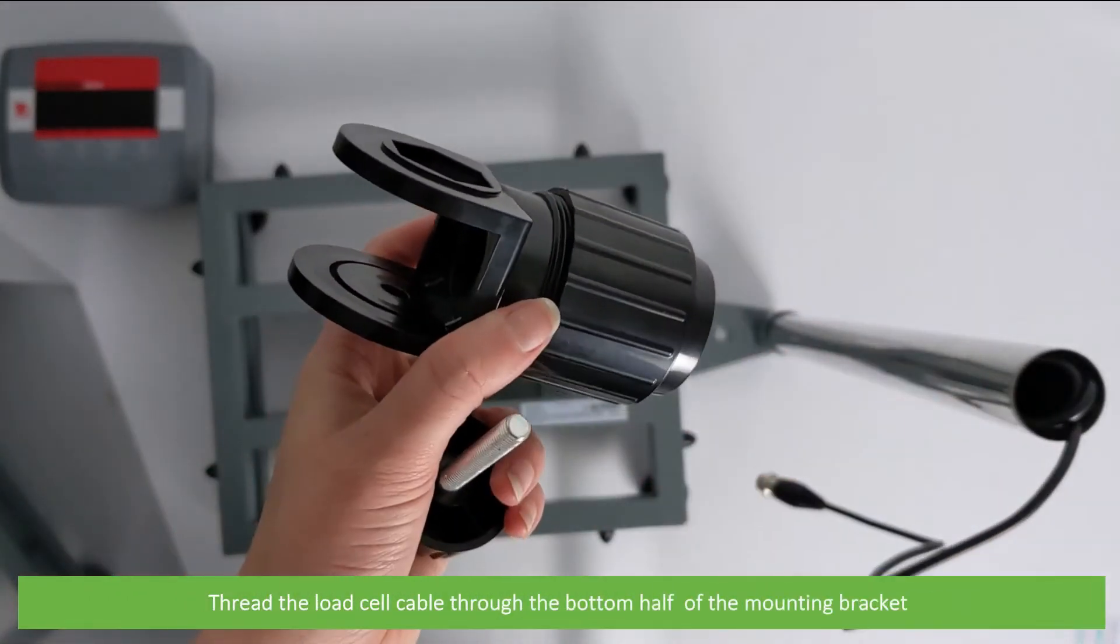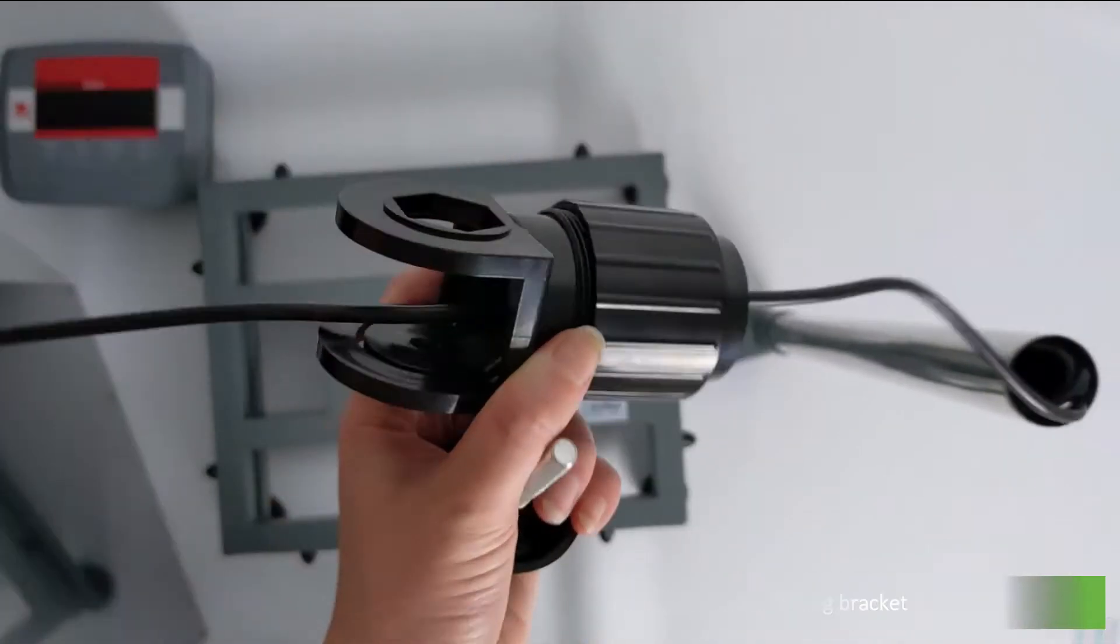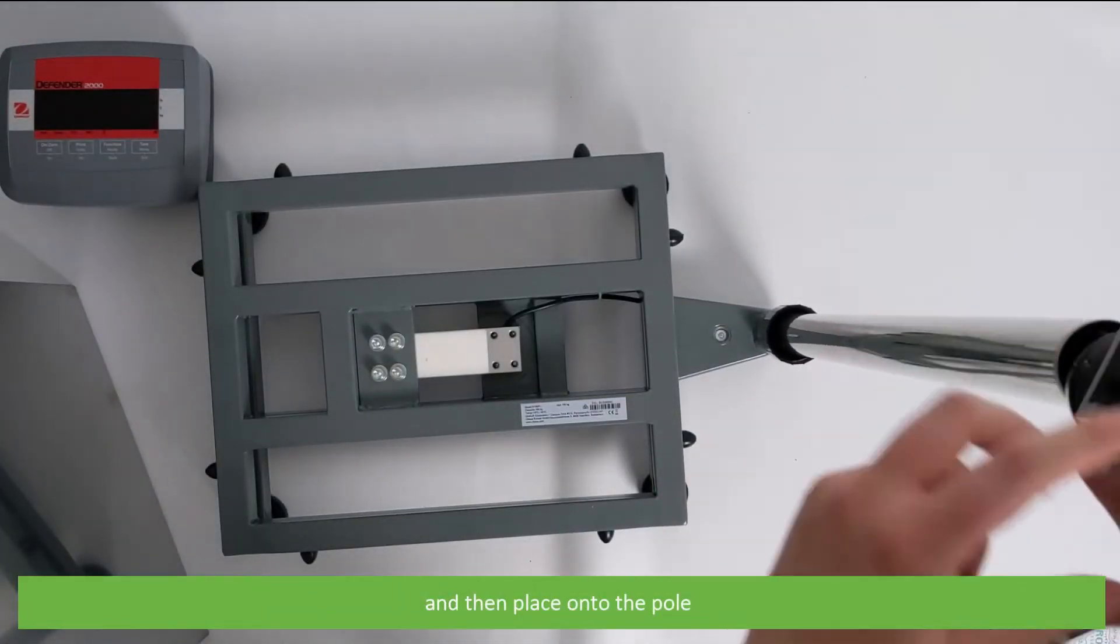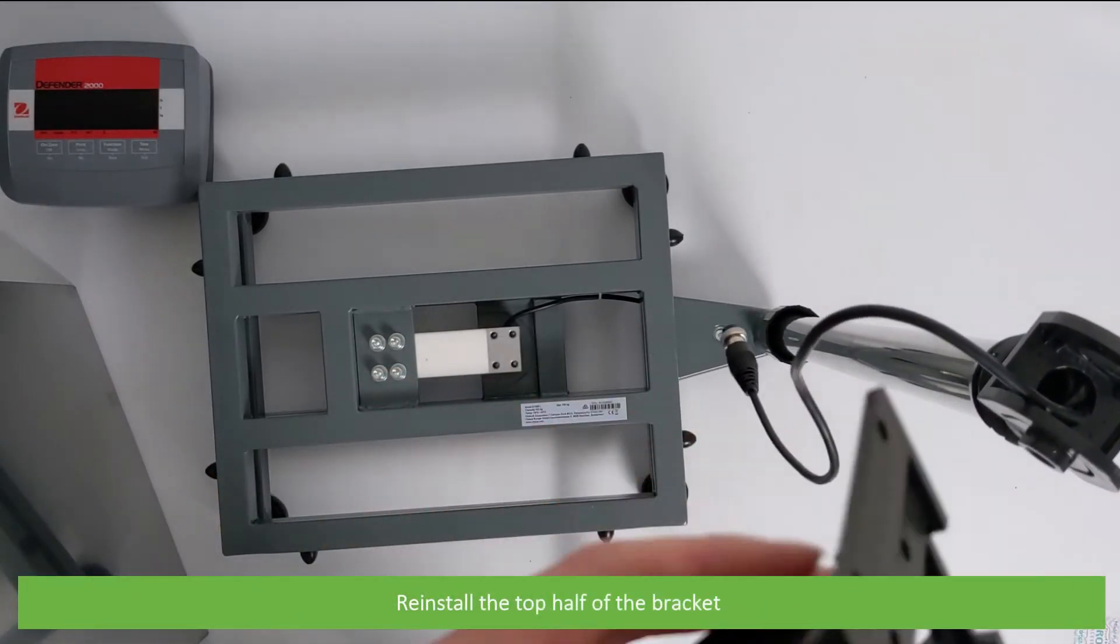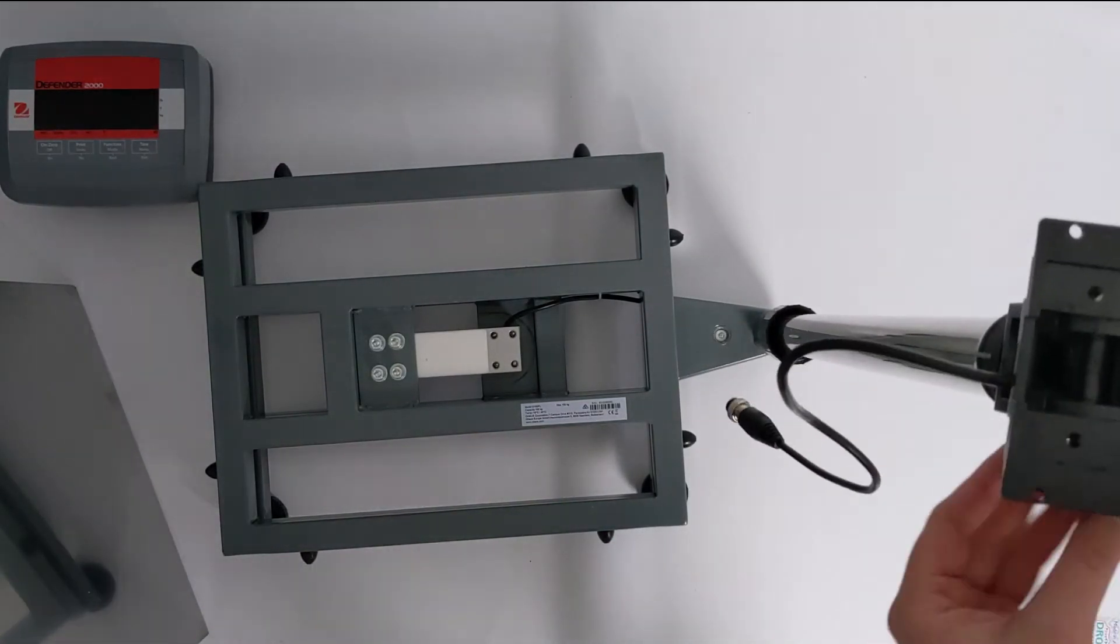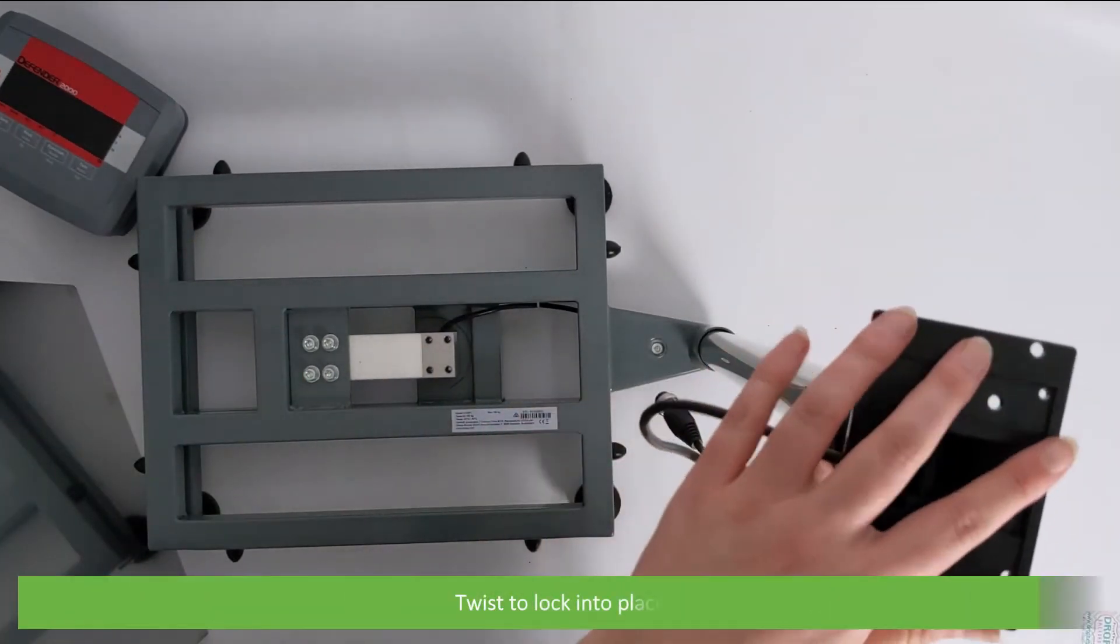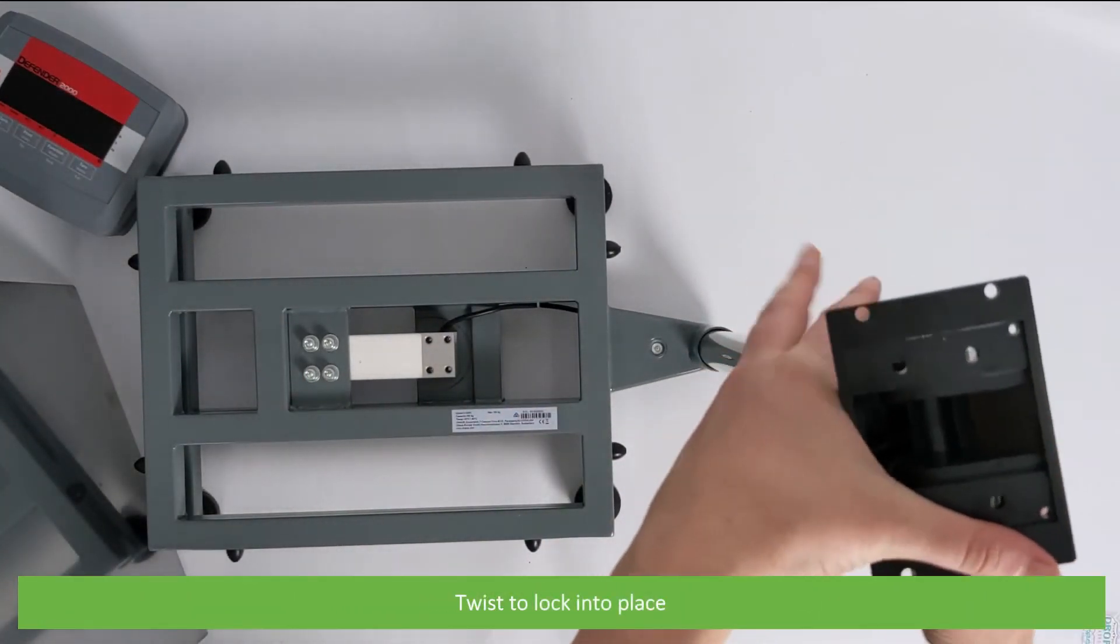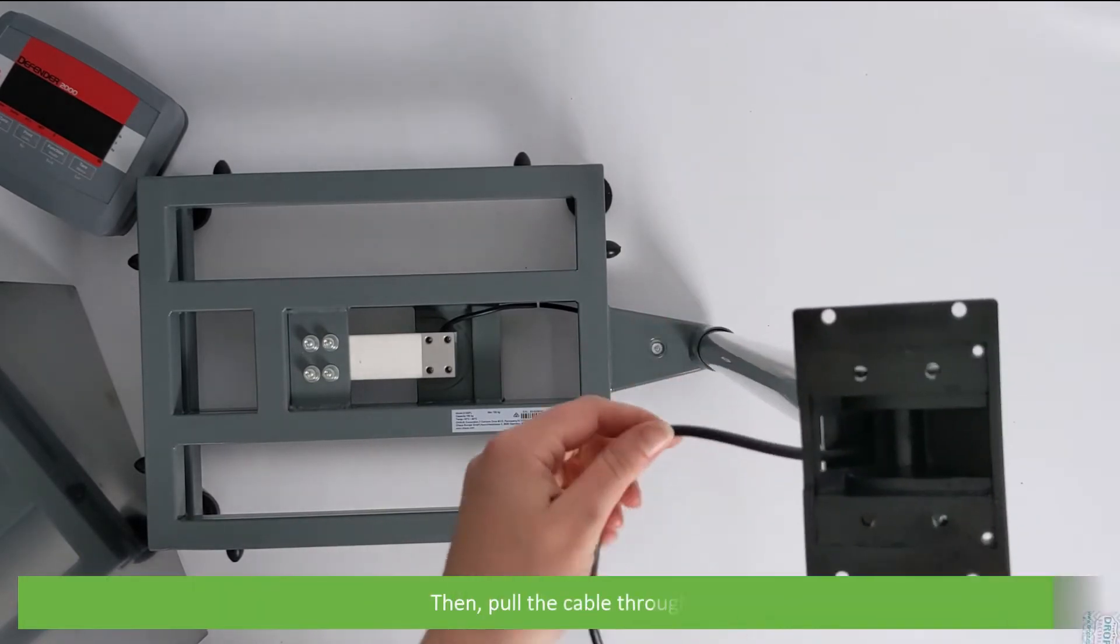Thread the load cell cable through the bottom half of the mounting bracket. Then, place onto the pole. Reinstall the top half of the bracket. Twist to lock into place. Then, pull the cable through.